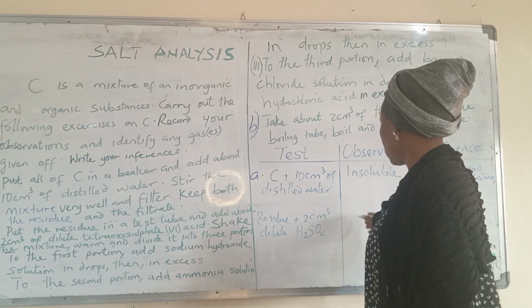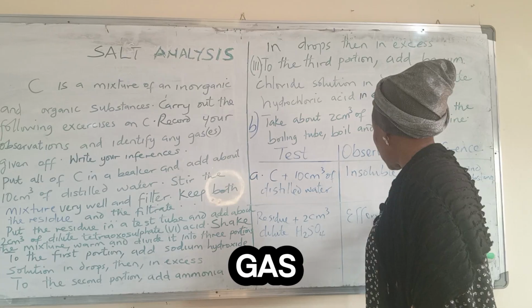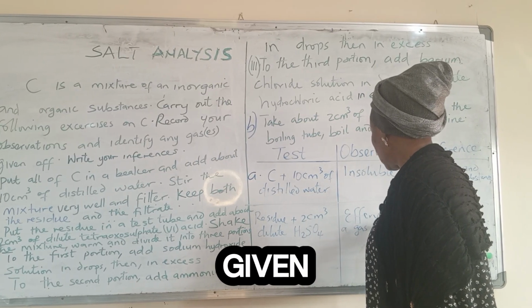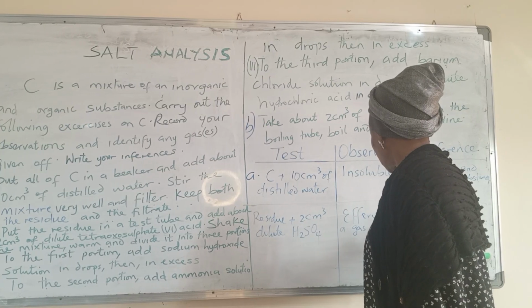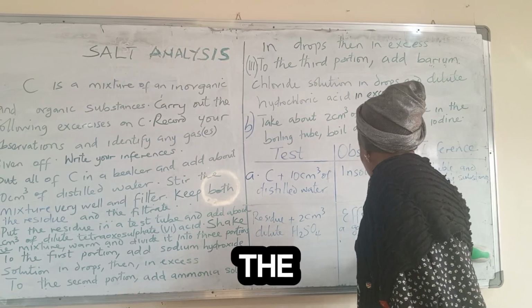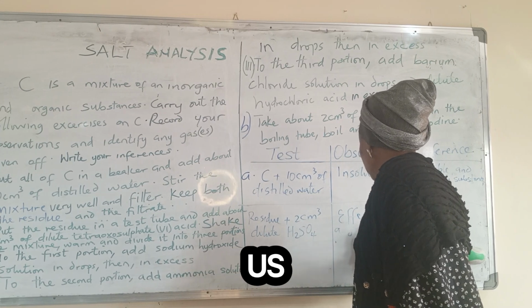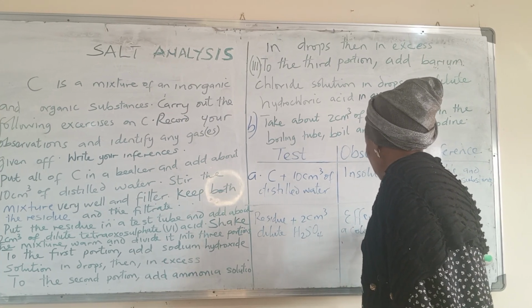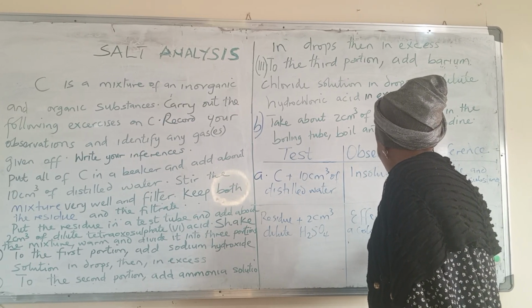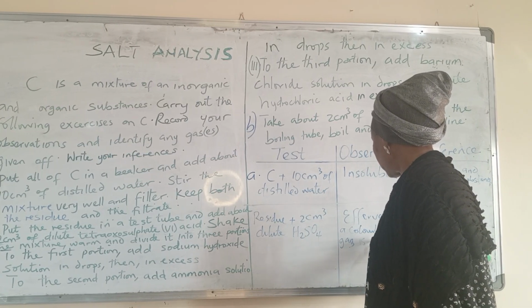You see effervescence, a colorless, odorless gas given off.